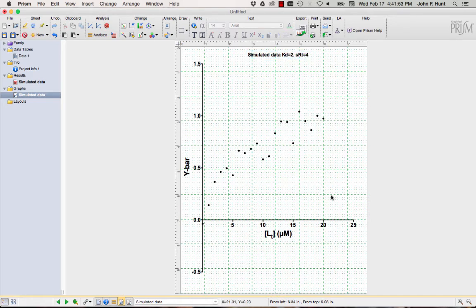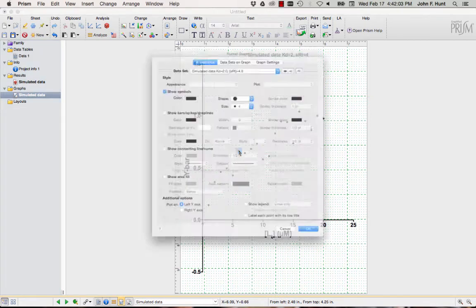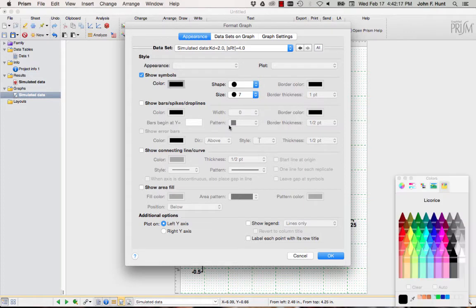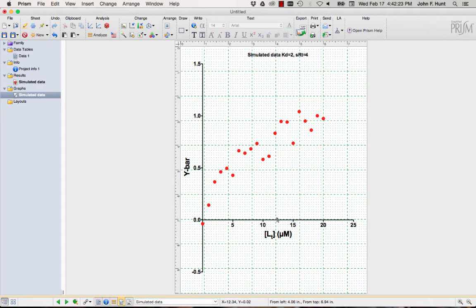Okay. So now what I can do is try to curve fit these data. And so now I've simulated data with some noise. We don't expect them to match the theoretical relationship exactly because the noise skews the measurement from the ideal value. Maybe make these measurements a little bit bigger. And maybe I'll make the data points red. This can stand out more when I do the curve fitting. Voila. All right, now let's curve fit this and see what we get.